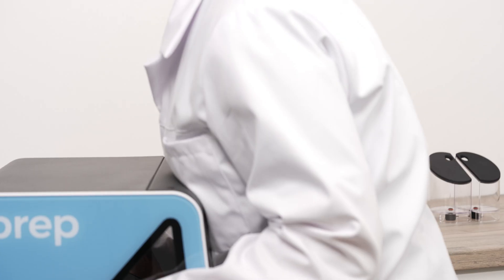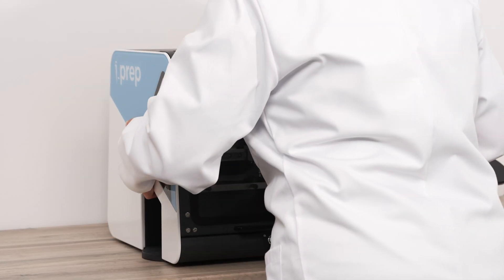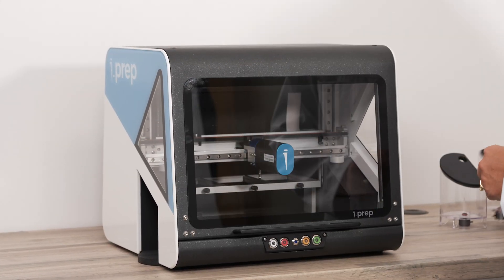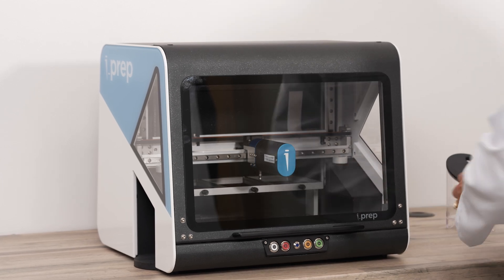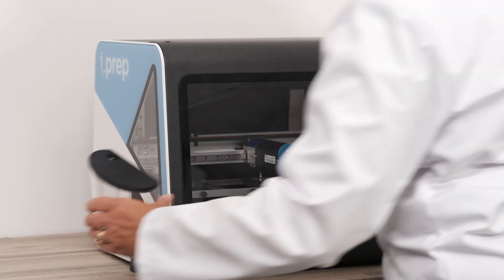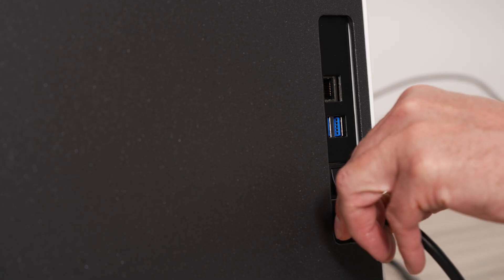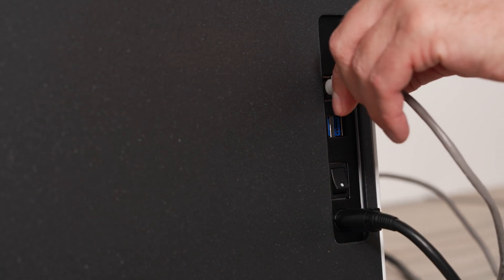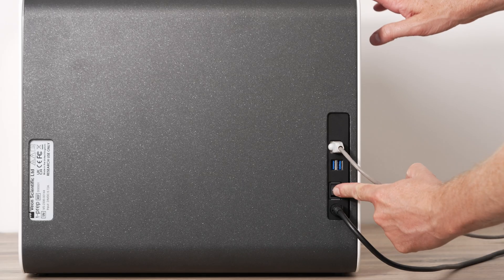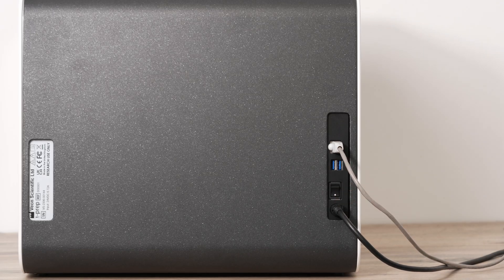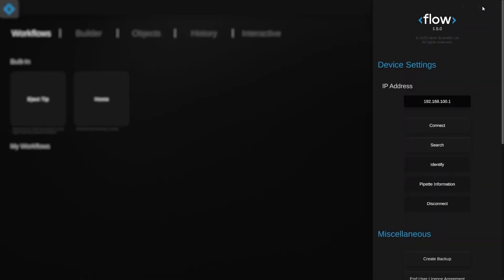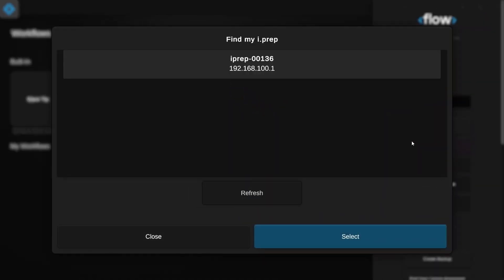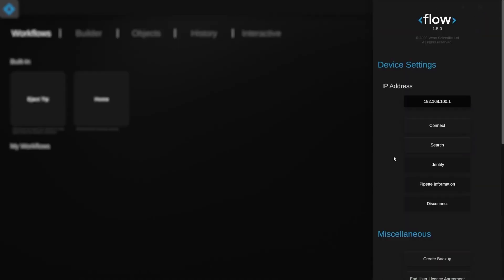iPrep's small form factor allows for quick and easy installation. The device is lightweight at only 16 kg, so it can easily be moved into place. Connectivity options include direct connection over Wi-Fi or network connection over Ethernet or Wi-Fi. The Flow software application allows you to quickly identify your iPrep on the network and establish a connection.